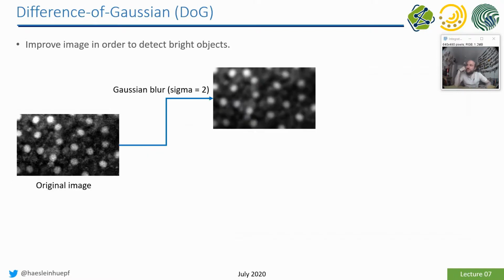And furthermore, there was a question of what's the difference between noise removal and background removal. If you think about these 2 things, there's a very nice example of a filter which does both things at a time. That's the difference of Gaussian. Maybe you remember this one. So we see our original image. There's some noise present. So we see fluctuations of intensities everywhere. It's not like there's just white and black. There are many different shades of gray. And we can also see that they are locally changing a lot. This is what we usually refer to as noise.